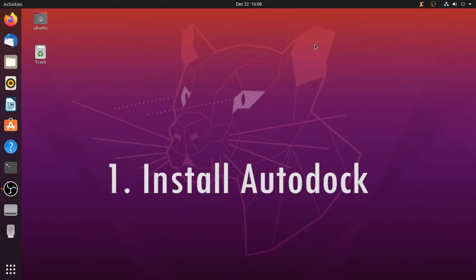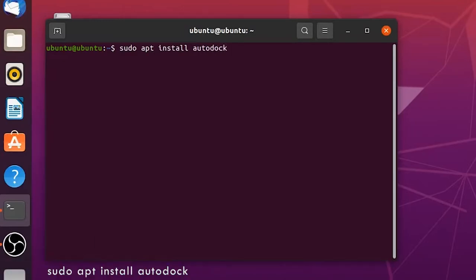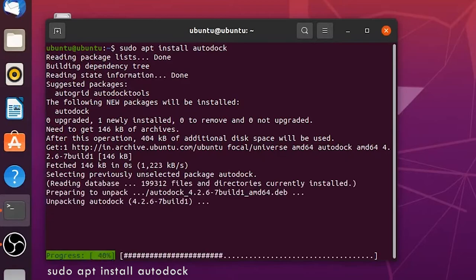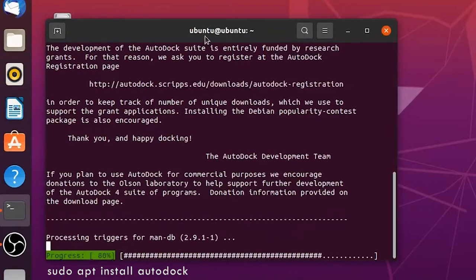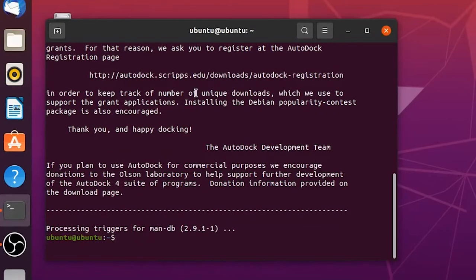First we are going to see how to install Autodock and Autogrid. Press Ctrl Alt T on your keyboard to open the terminal and give the command sudo apt install autodock. That's all, it is very simple, this command will install Autodock 4 on this system.